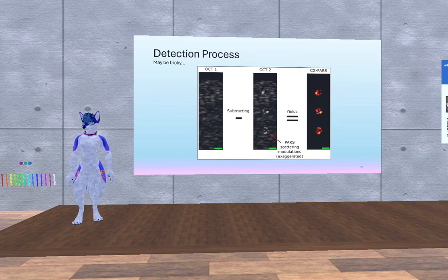And then changes in pretty much any kind of material property, like changes in the density, brought on either by a pressure wave or a thermal wave, something like that coming through, will alter the refractive index.